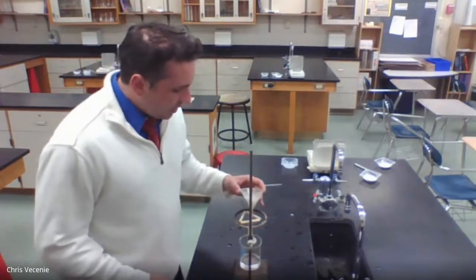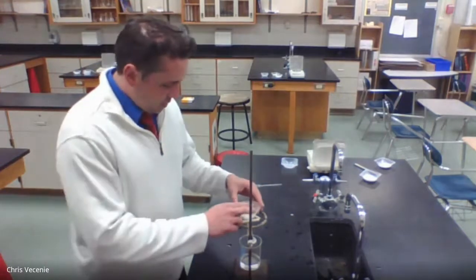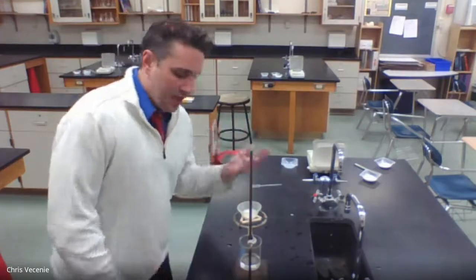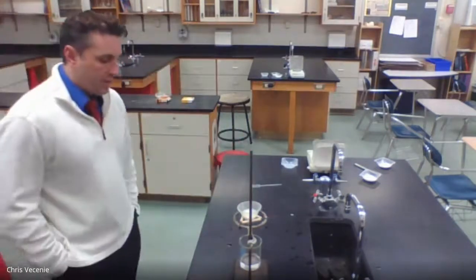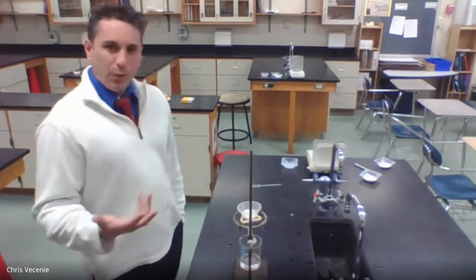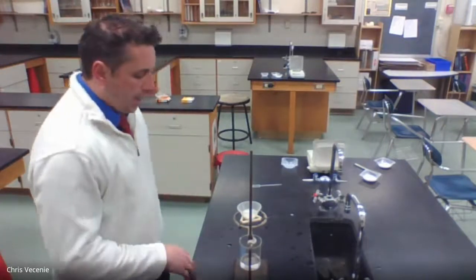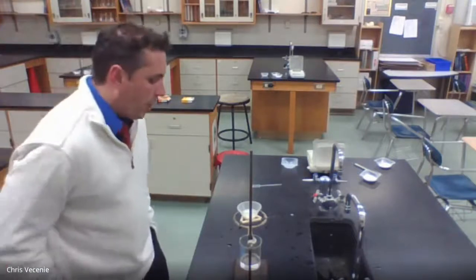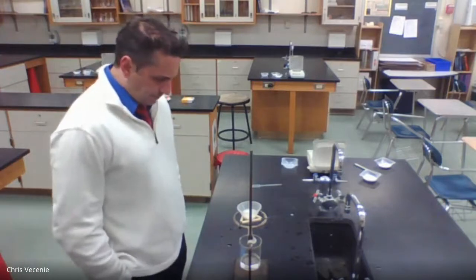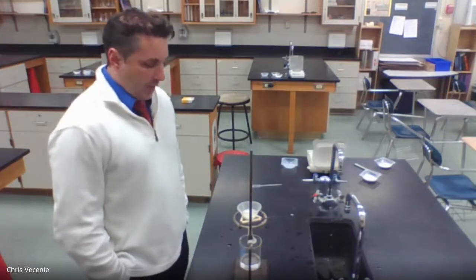So looking like we're pretty much there. Sometimes you can give it a tap just to help it along. And this process is called gravity filtration because I'm not using any type of aspirating system, which would be one where I'm creating pressure differences and forcing the liquid down through. That's why this one takes just a little bit longer. But on the whole, it would have been excessive to set up the whole filtration. And a lot of times you end up taking some solid with you, which we don't need to.